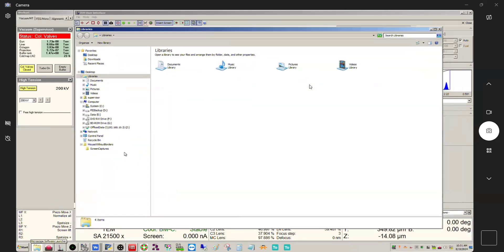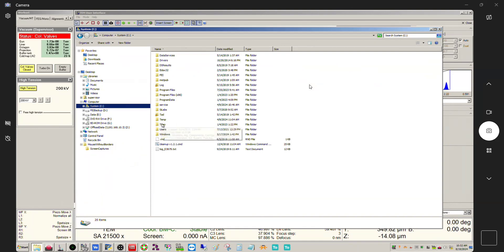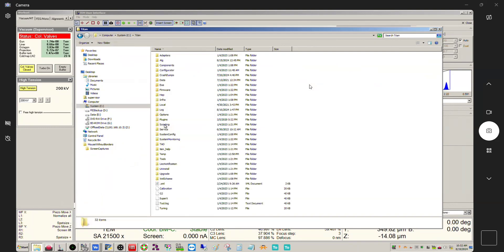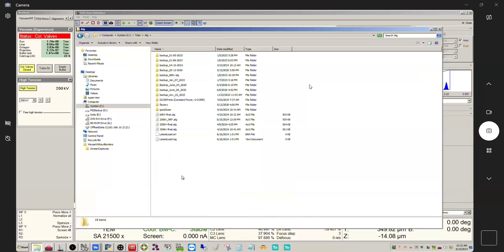So, open up Windows Explorer here and you want to find your system drive, so C in this case. The folder you want to find now is Titan. Now depending on your microscope, if you have a Talos this might be labeled differently I'm not sure, but it's going to be in your system drive. Open this and then the folder you want is this alg. This contains your alignment files.